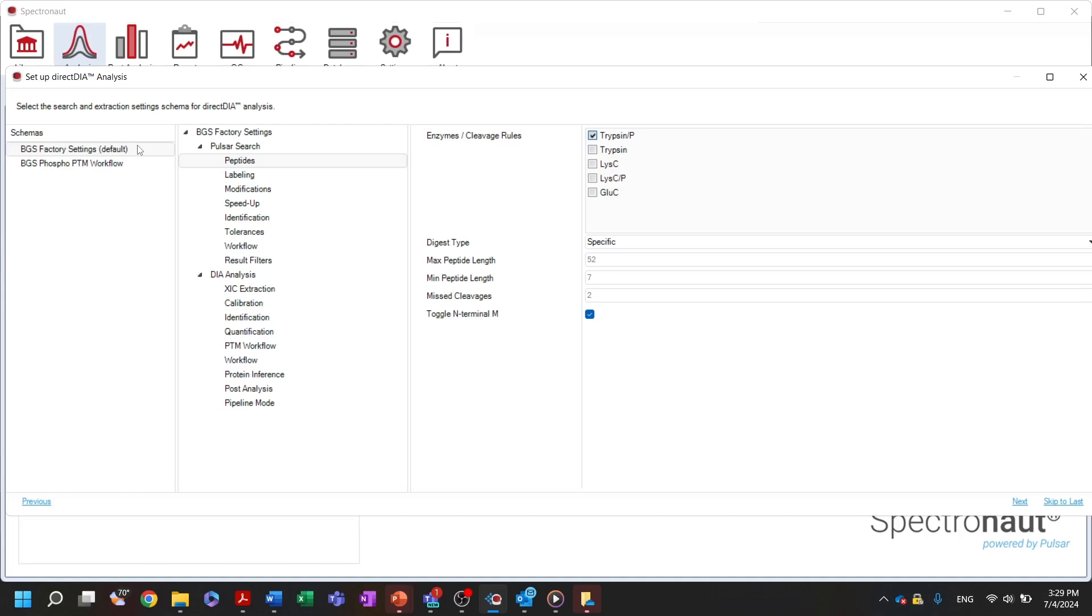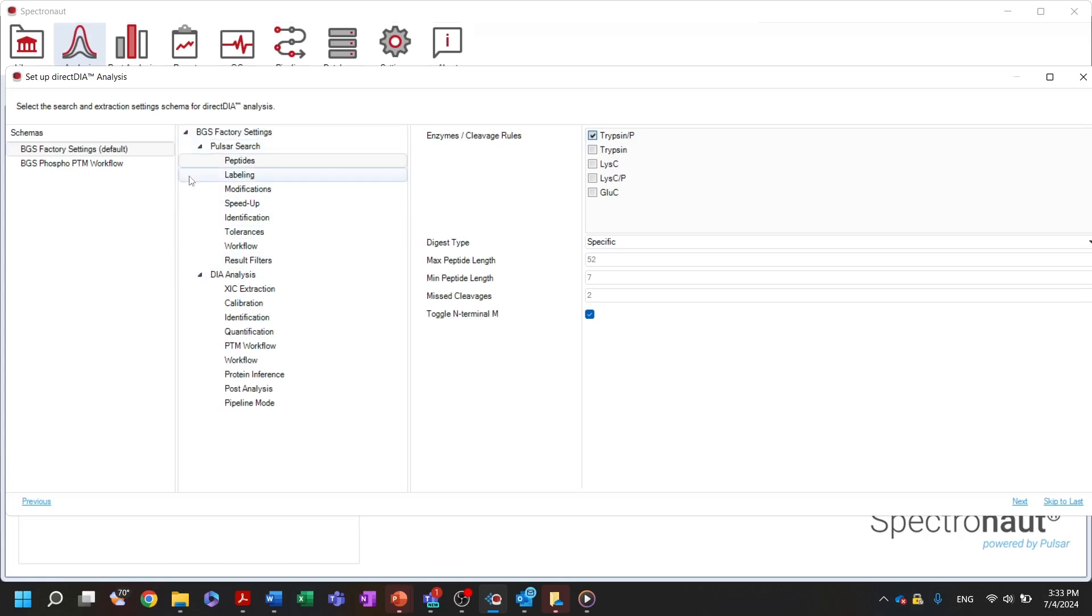Here you can select your own settings schema, predefined in the settings perspective, or you can change the settings directly in the wizard. You will notice immediately the direct DIA settings consist of two parts: Pulsar settings for the spectrum-centric search and DIA analysis for the peptide-centric data extraction and quantification.